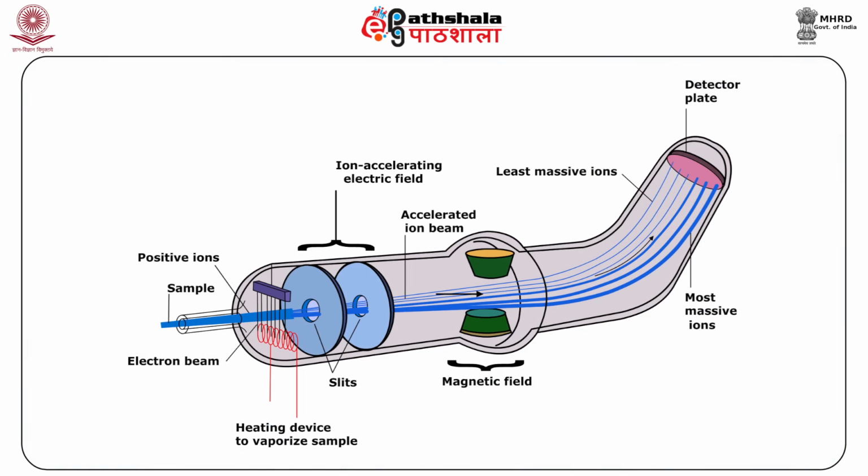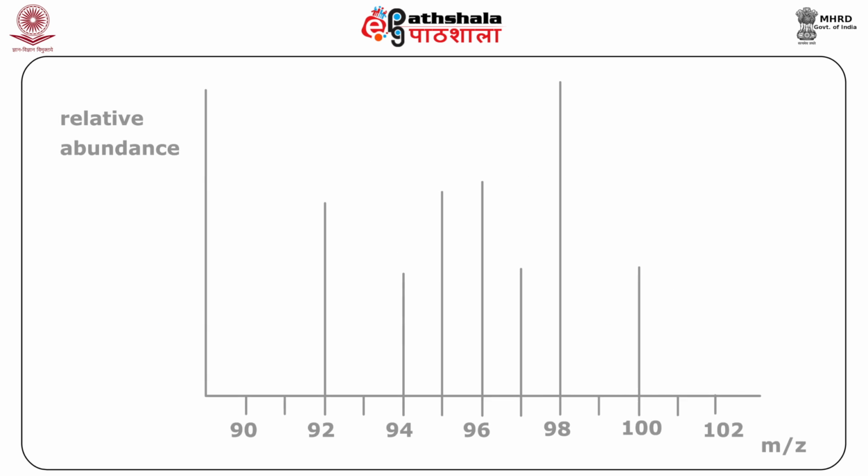The principle of a mass spectrometer is best explained by studying the figure. A stream of the volatilized sample is bombarded by an electron beam which generates positive ions. The ions are accelerated and passed through a magnetic field and filter which removes the larger and smaller ions into a mass analyzer which gives a spectrum as indicated in the figure.